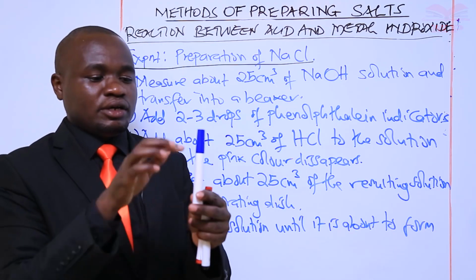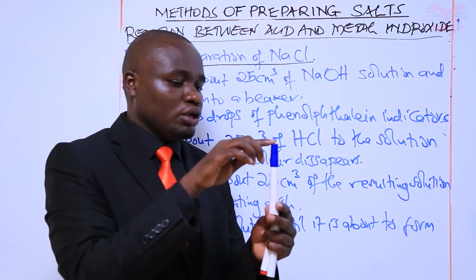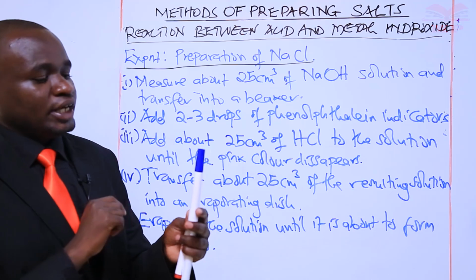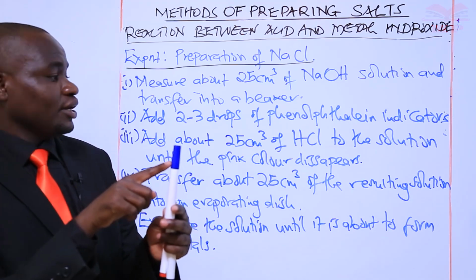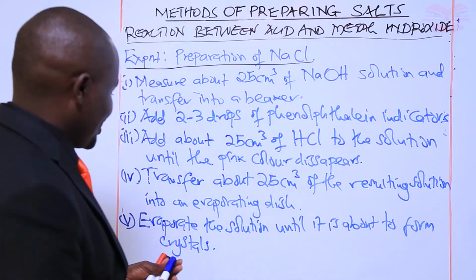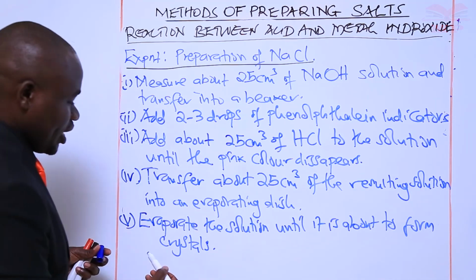You allow it to cool down, after which you will observe the crystals. The crystals will be seen on the glass rod. That will mean the solution is ready to form crystals. Then after that, you allow it to cool.